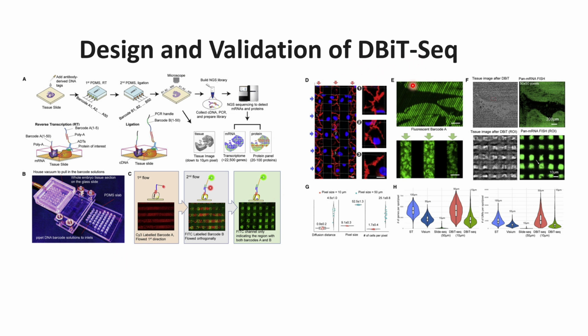And after that, they further decided to check whether there is a leakage in the Z directions or not. So for this, they did the confocal images, and when they checked the signals in the Z directions, they could see that there is also no leakage in the Z directions. And these images are for the fluorescence mRNA FISH, that is fluorescence in situ hybridization.